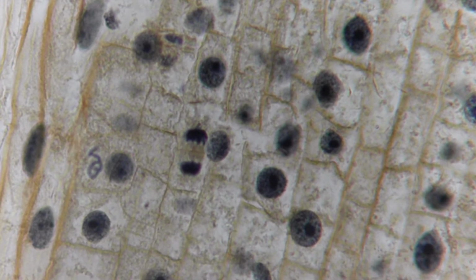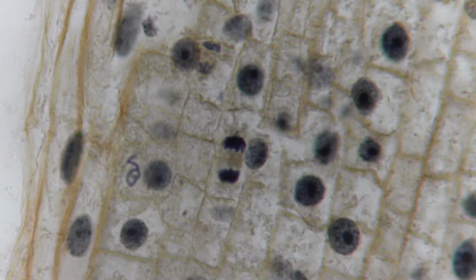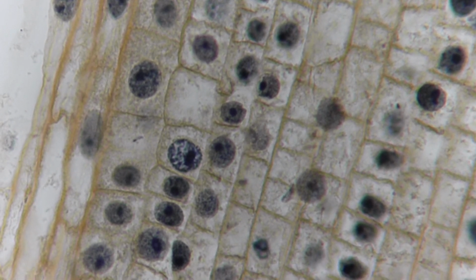So what will happen, the chromosomes will start rounding up in a round shape. A membrane will form around them. The chromosomes will break up again to where you can't see them into specifically the chromatin network, and they're just going to be two smaller interphases. I'm going to ease back down, and here they are.